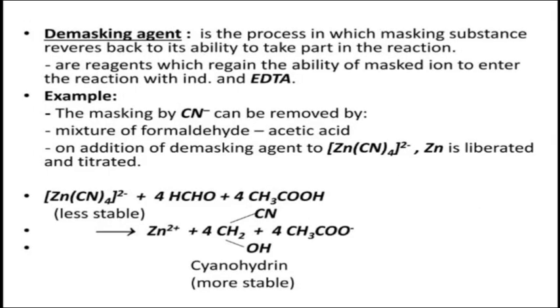Demasking agents: this is a process in which the masking substance is reversed back to its ability to take part in the reaction. Example, cyanide.